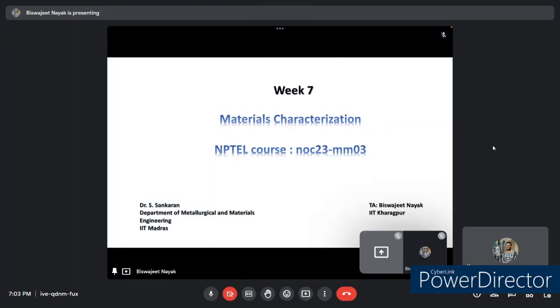Hello everyone. Today we are going to discuss the topics covered in week 7. That is some introduction on the XRDs, and I'll be mostly dealing with the concepts through questions, and some concepts I will be talking about whatever will come in the questions accordingly.